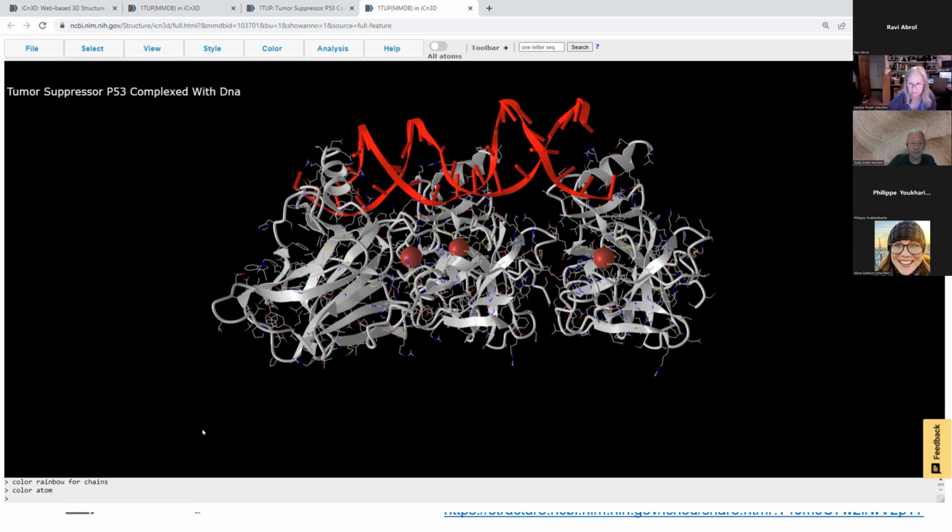The very interesting thing about domains, which you can see easily with color, is that your domains fold with either the N and C termini far away, or with the N and C termini coming together. With color, you will spot immediately the kind of domain you have. These domains may get piped into each other sequentially, forming a very long chain, or they may be more like plugins for each other when the N and C termini come together.